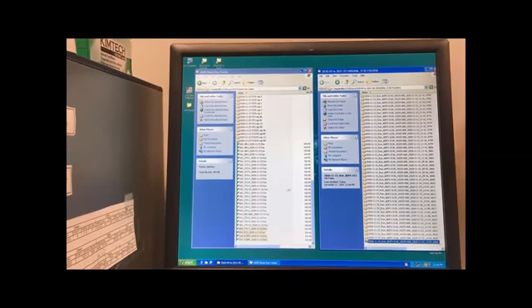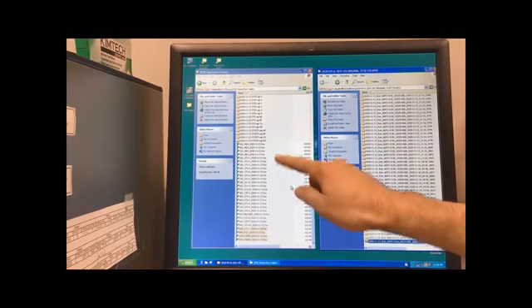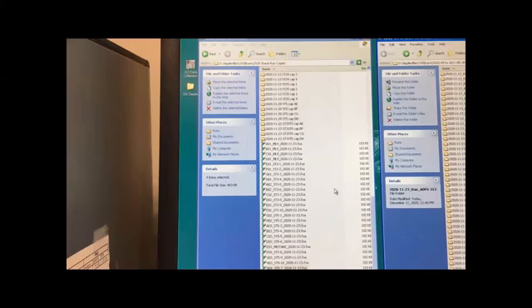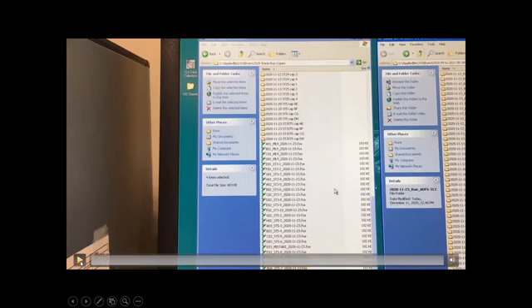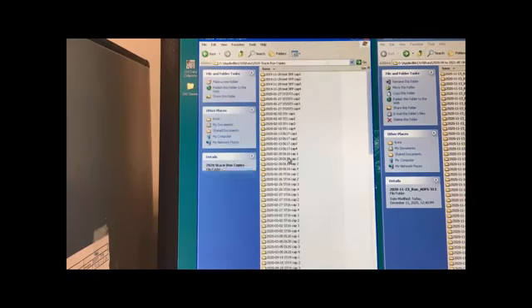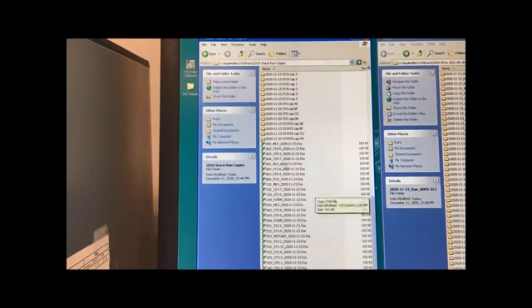Okay, now that they're all in that folder, we can arrange them and put them in the proper AE or BF or CG folder. So how are we going to do this? Did I show you? No, okay. The first thing to do, let's get them in alphabetical order. I think what I'm going to do is just go up, and then go into that folder again, scroll down, and now they're all in alphabetical order.